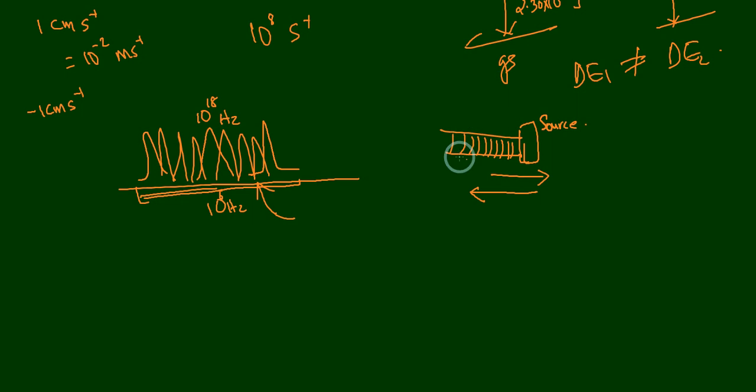So the source can be moved forward and backward just by rotating the screw at a constant velocity at a time. Adjusting the cycles per second of the movement of the screw, you can adjust the velocity, and then you can cover a range of frequencies at different source velocities, and find out the exact frequency range where the sample will absorb the gamma ray frequency.